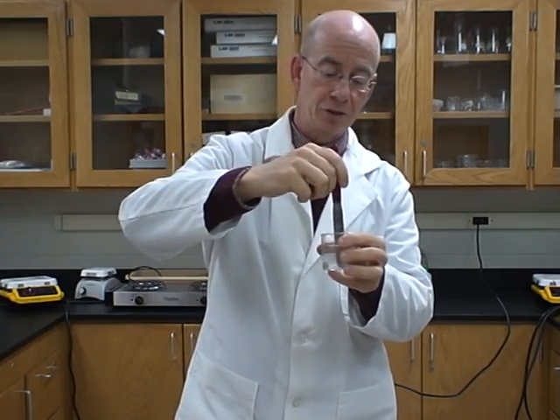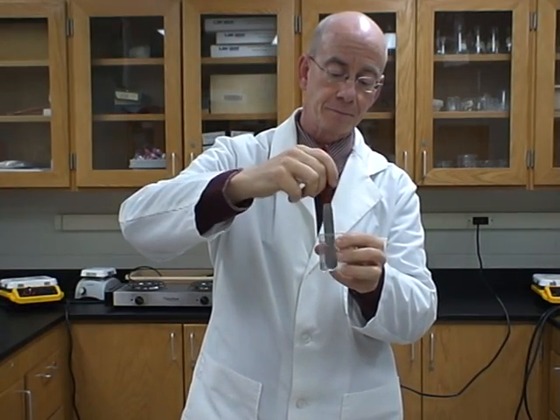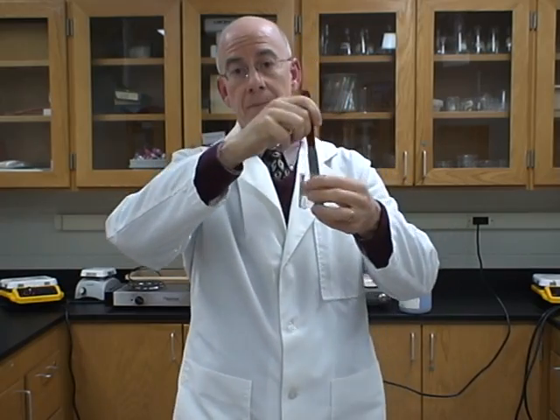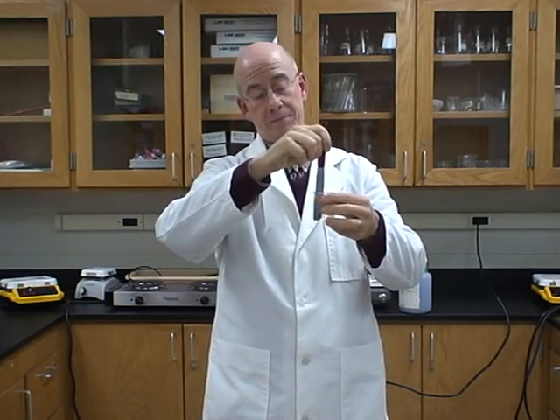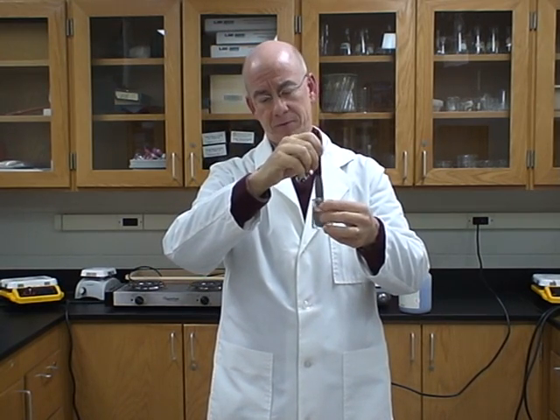Okay, next I have a beaker with some sugar in it. And what I'm going to do is add water, and we're just going to mix it around. Okay, so I added water. And I'm going to stir it around. And if all goes well, the sugar is going to disappear. We call that dissolving. So is dissolving a physical or a chemical change?